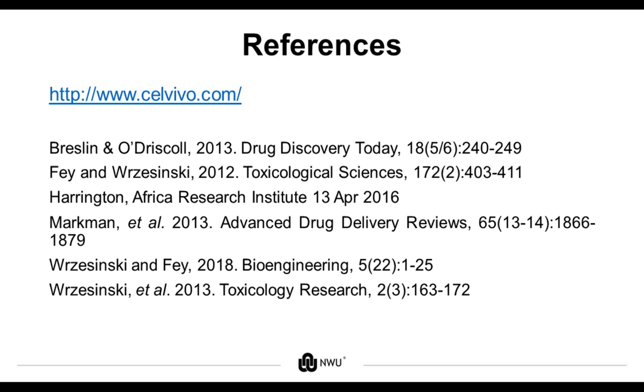After such a long culturing period, how big are your spheroids and how deep would the nutrients or cancer drugs have penetrated through the spheroid? Well, our spheroids cultured in the clinostat-based rotating bioreactors can reach up to a size of 1 millimeter in diameter, although this can vary depending on the type of cell line you use.